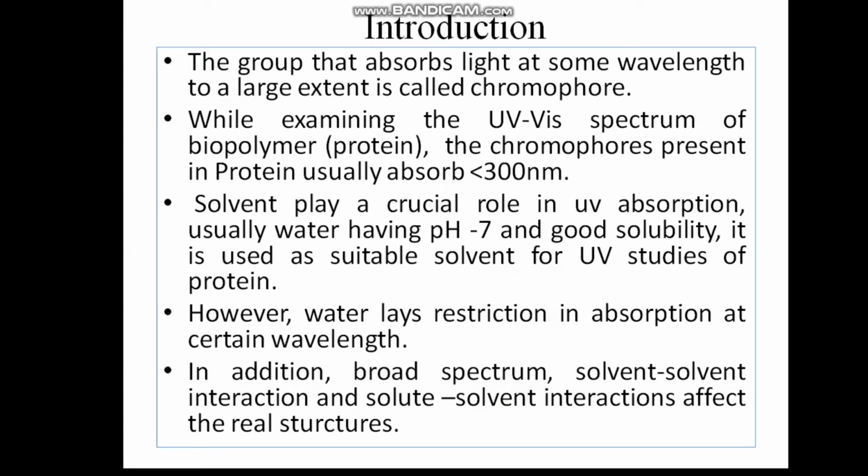But the same water also comes with some limitations, meaning it places restrictions on absorption. It holds back the free absorption of the protein. Why does it restrict some absorption or alter the absorption pattern? It is because of solvent-solvent interactions or solute-solvent interactions, or, it being a polar solvent, it may contribute dipole effects.